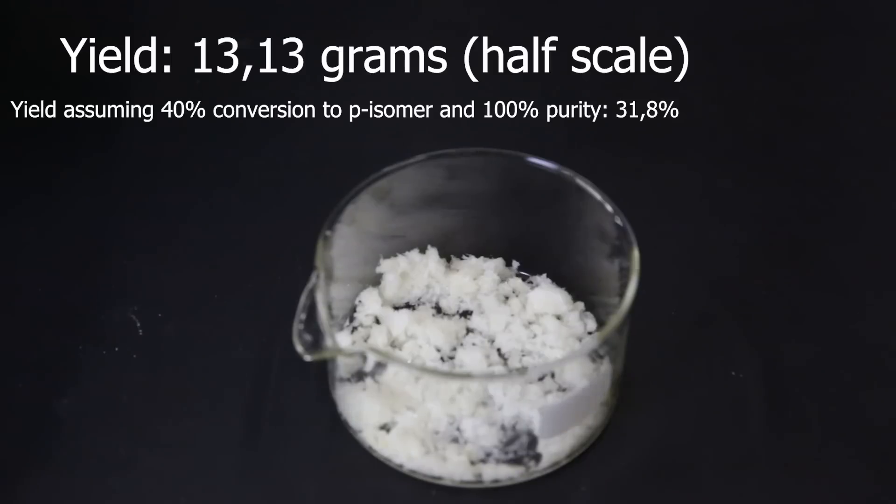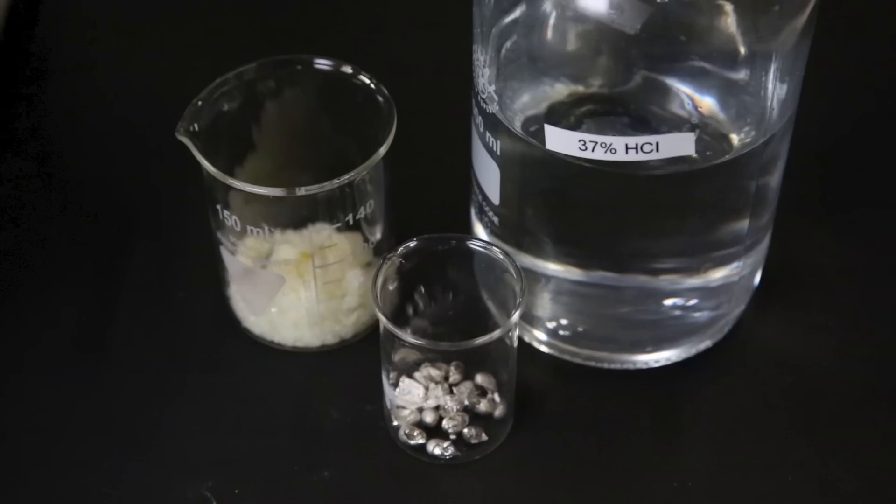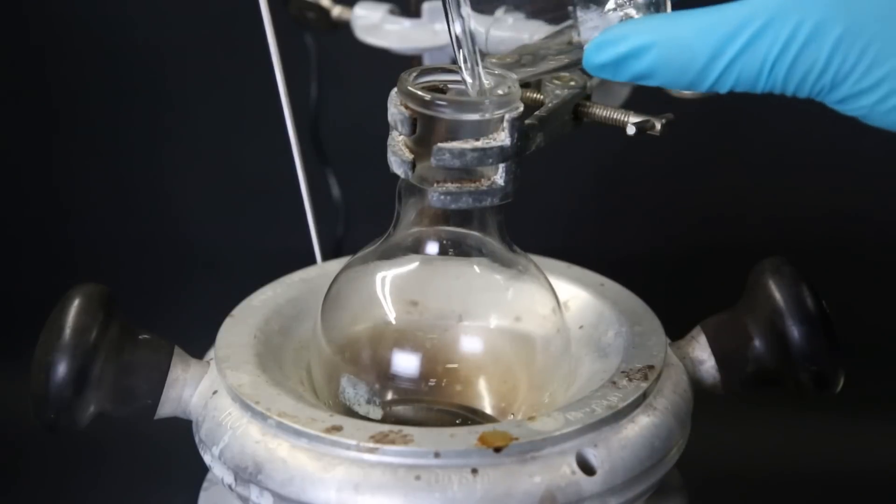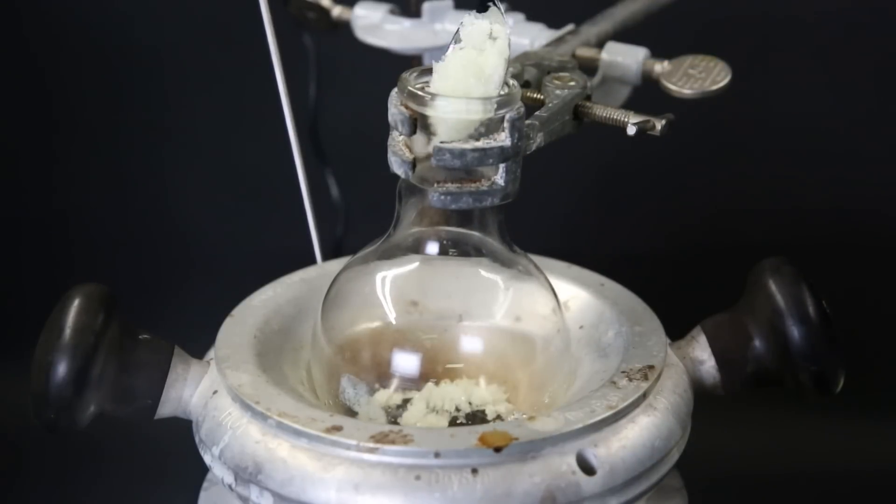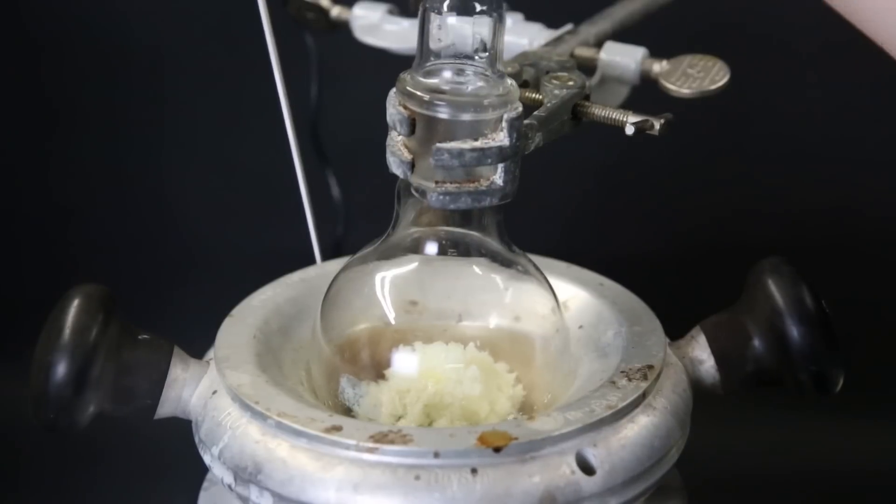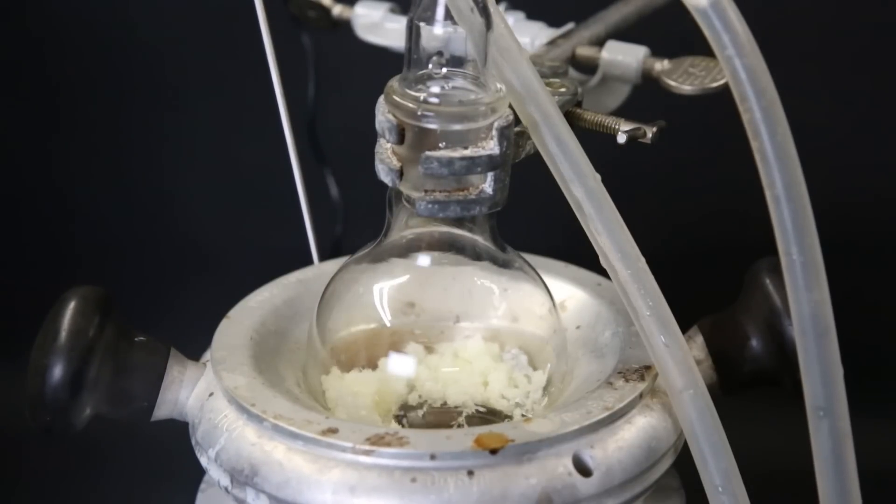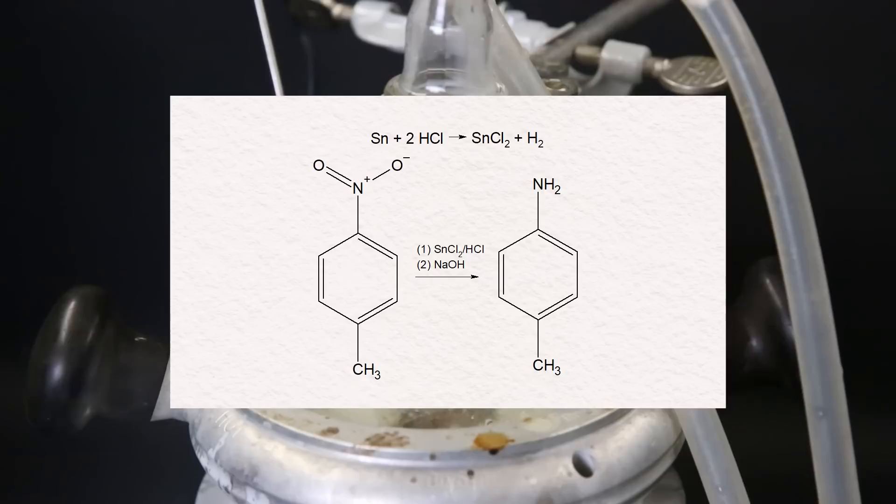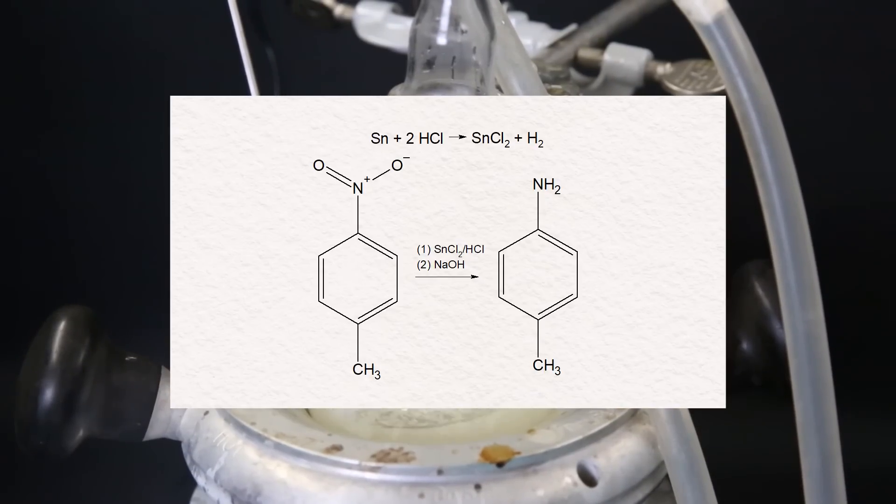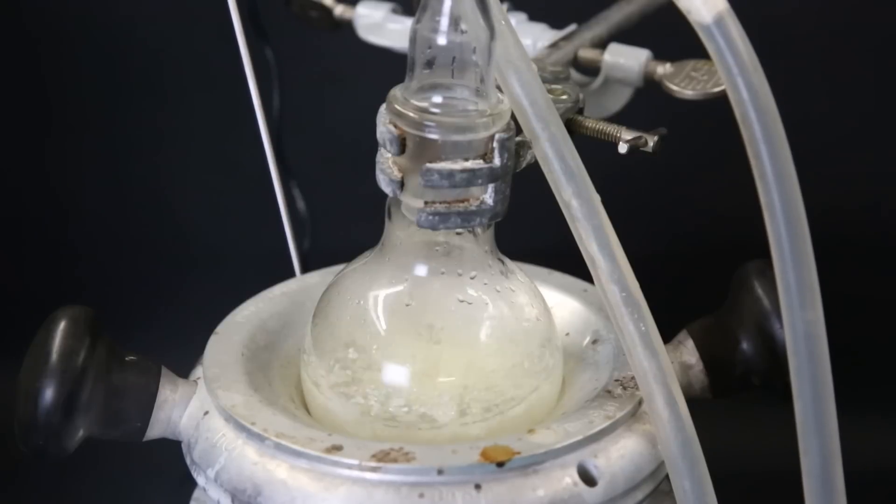I come back a few days later, and it looks basically the same. Now the next step is to reduce the nitro group to an amine. To do this, I will use tin-2-chloride as a reducing agent, which will be produced during the reaction. So I set up a flask with a stir bar, and I put in the tin metal and added all of my para-nitrotoluene on top. I then add a condenser on top and start stirring, then I gradually add in 30% HCl through the condenser. This will convert the tin metal to tin-2-chloride, and together with the excess acid, this will reduce the nitro group to an amine. After the first reaction, the HCl salt of the product is formed, which can be free-based by adding a sodium hydroxide solution as the next step. When all of the HCl is added, I heat the mixture and leave it to reflux overnight.